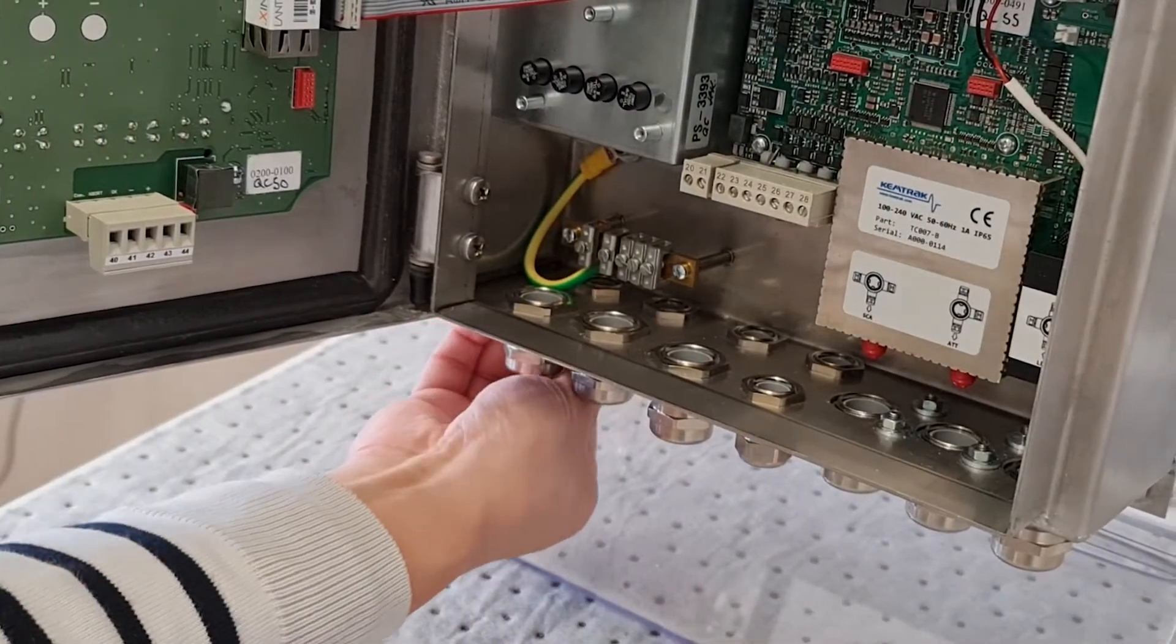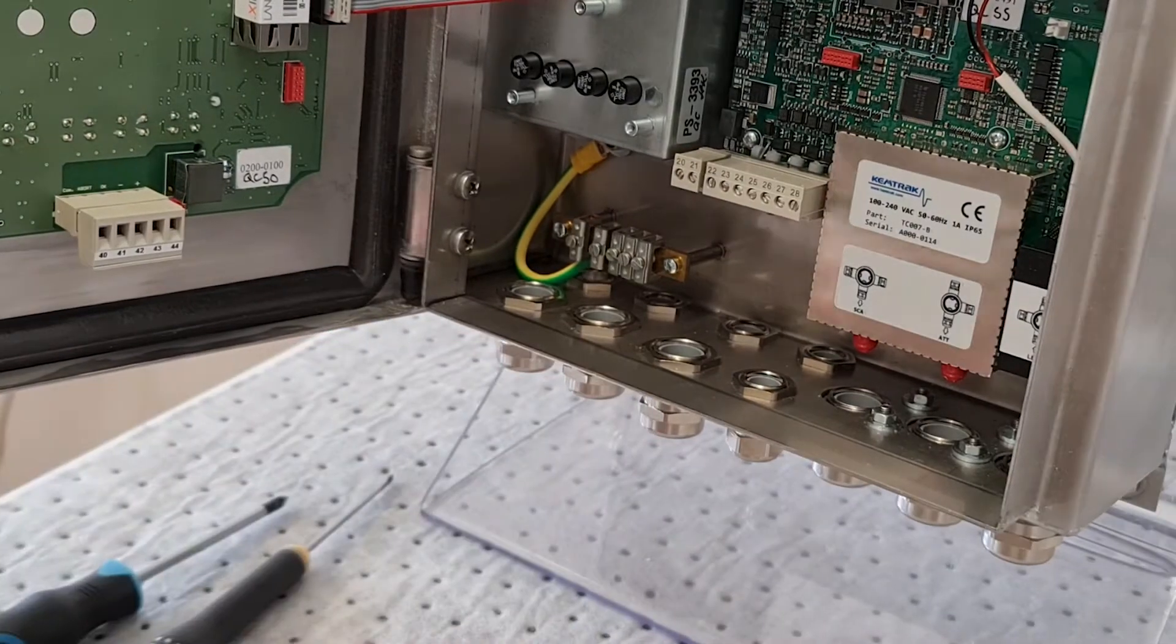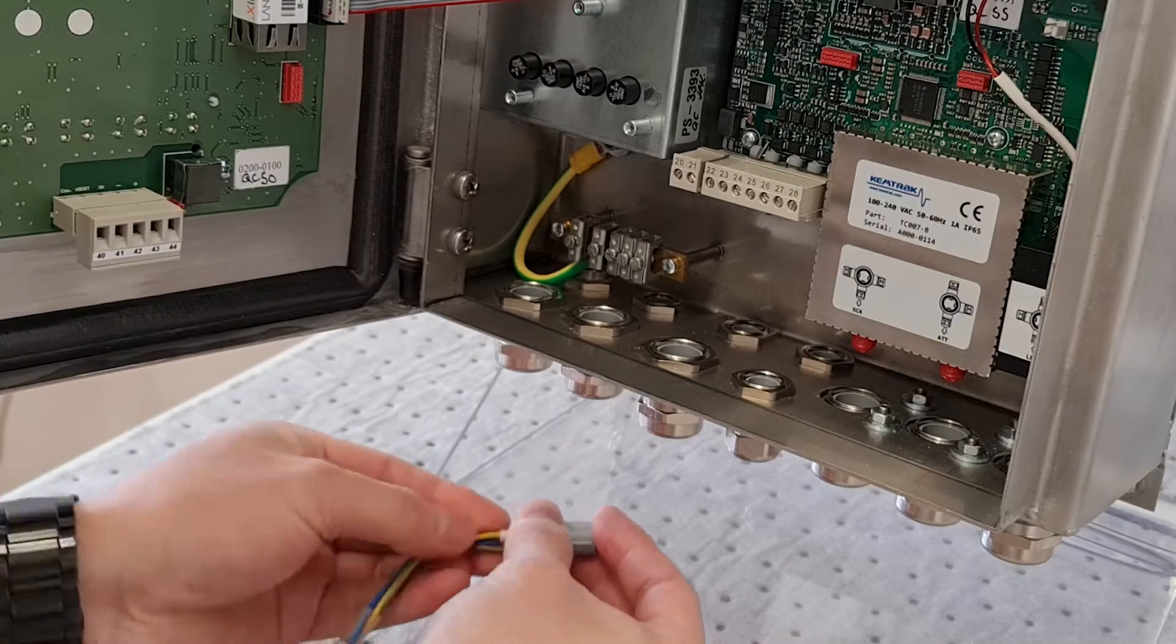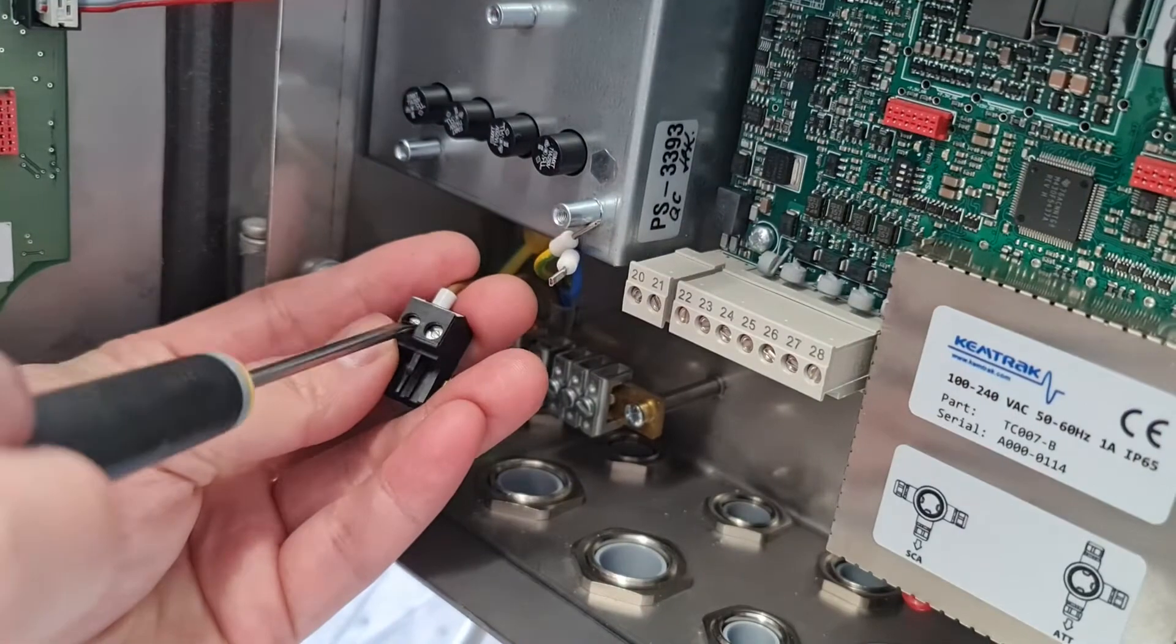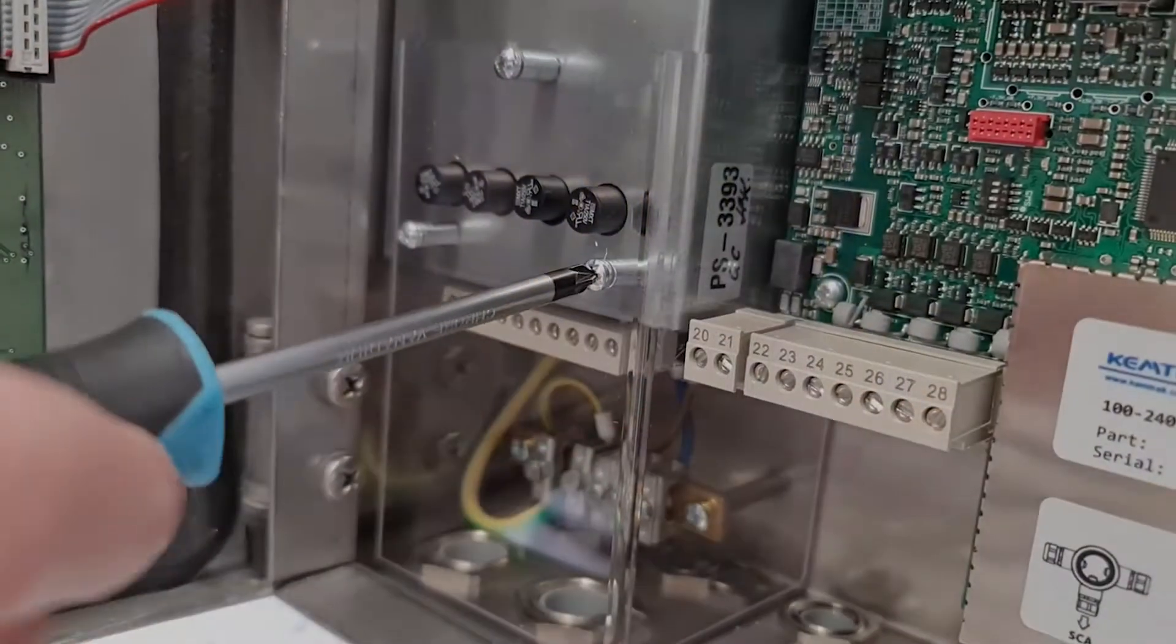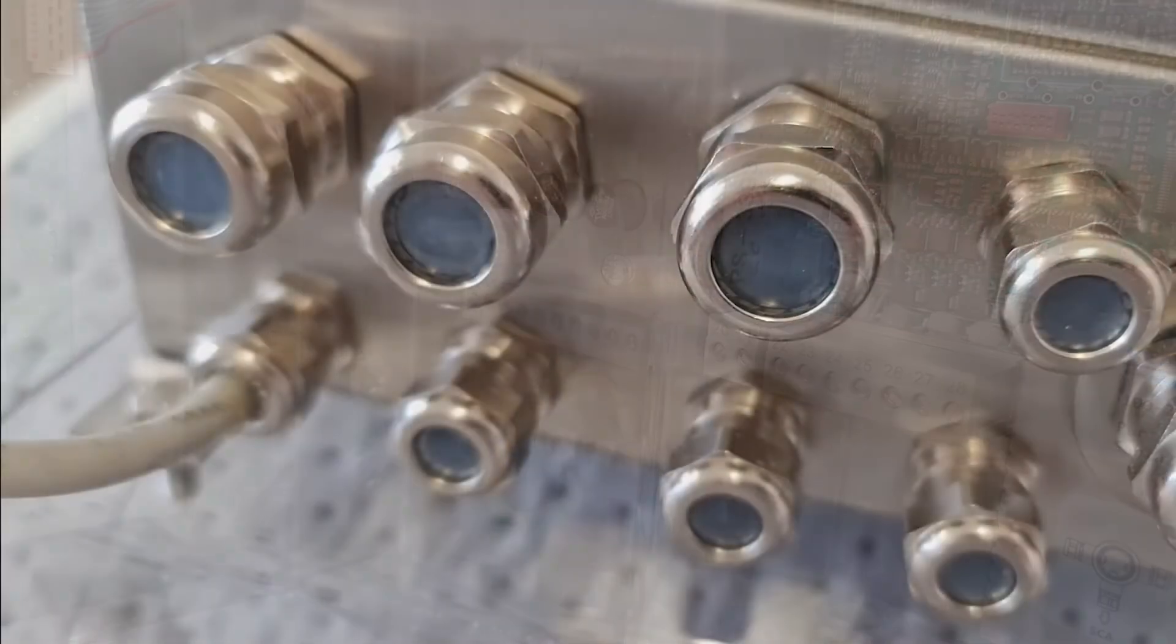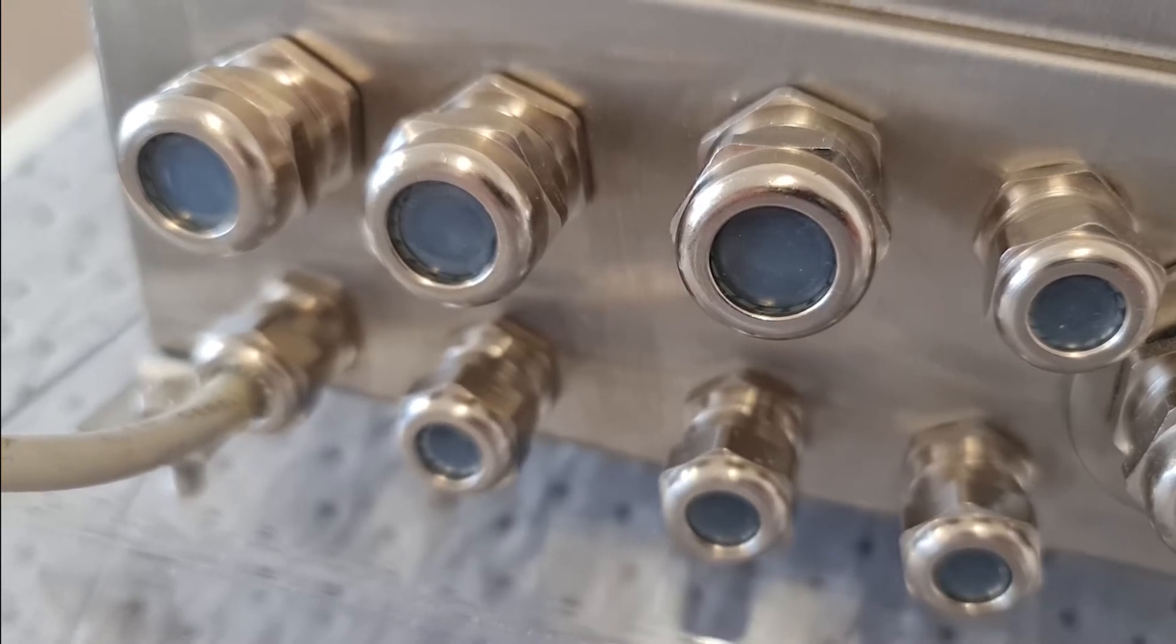Feed the power cable through the cable gland located on the bottom left of the analyzer enclosure. Connect the power cables to the connector and the earth wire to the rail. Replace the protective cover. Firmly fasten the cable gland and check the protective covers are in place on all the unused cable glands.